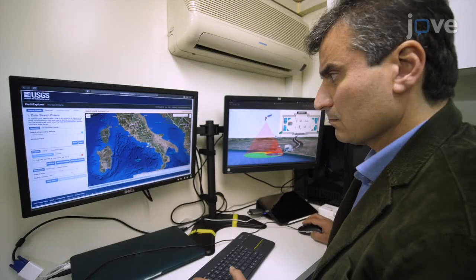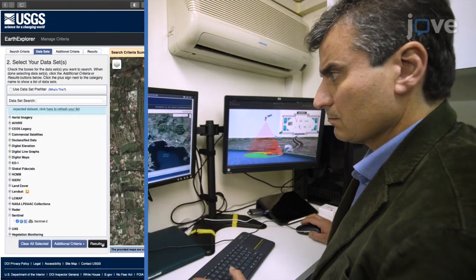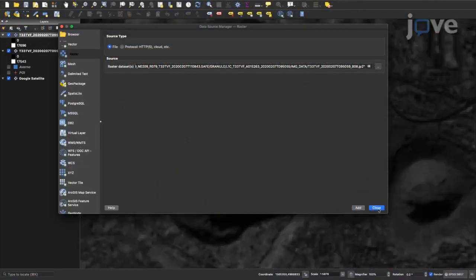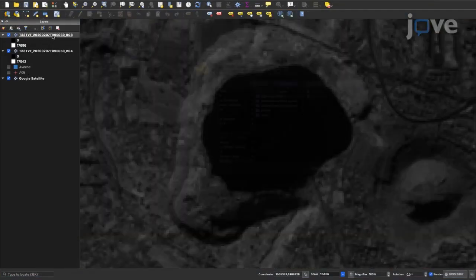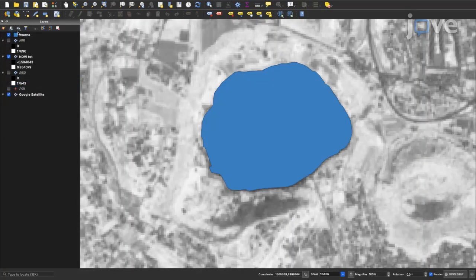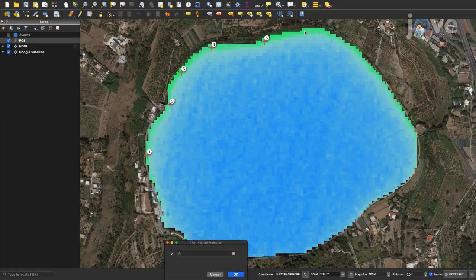For data retrieval, first locate the target area on a global world map and retrieve the data from various public and private remote sensing data sets for the collection date. After retrieval, process the raw data, calculate the multispectral indexes, and classify the resulting information. Then define the sampling sites on the generated thematic map.